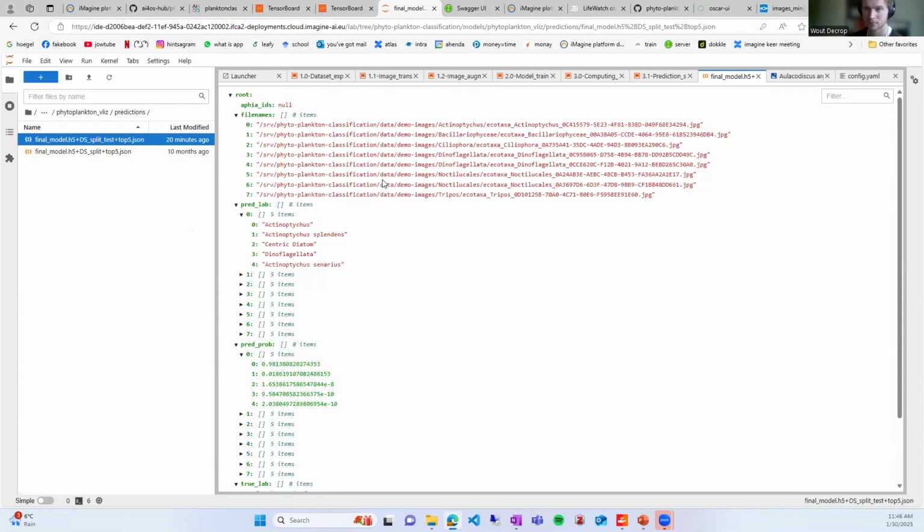Okay, so before going further into the chat, there are 2 questions in the Q&A part. Could you also say something about data compiling? You have images and prediction JSON files. How do you put them together? For example, the abundance in your sample.